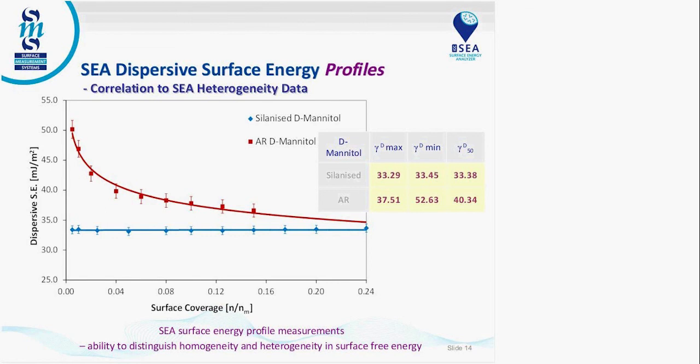It's just a database. If you could mention the wide range of choices for the solvents. Sure. We do have a wide range of solvents. There's a database in the system that you can load a wide range of solvents. The only limitation is the boiling point of the solvent. They should be below around 220 degrees C to get reasonable vapor pressure. But we do have experience. If you see something here that interests you, maybe on different materials, then just email us and we can send you some more information.